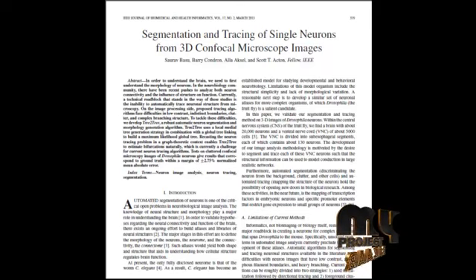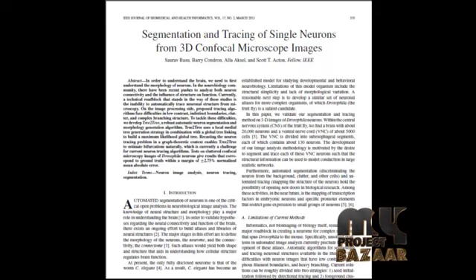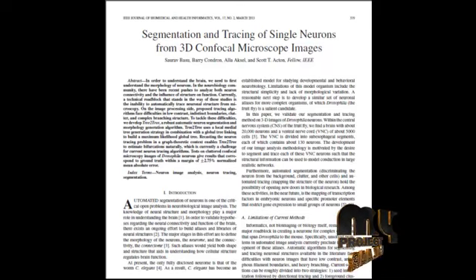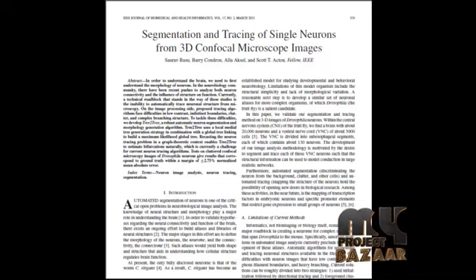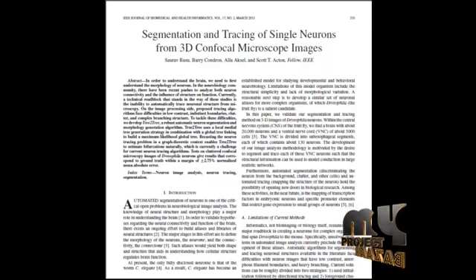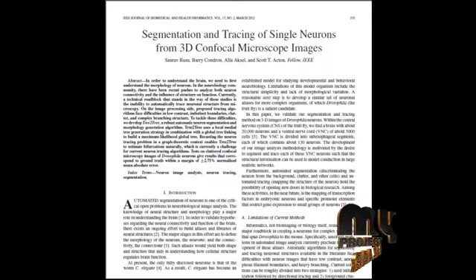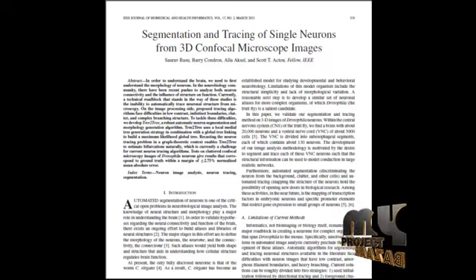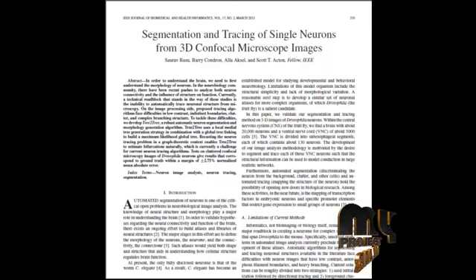In pre-processing, we remove the noise from the image and then enhance the neuron image. Then we find the gradient of the image, after which a binary image is generated for the neuron image.